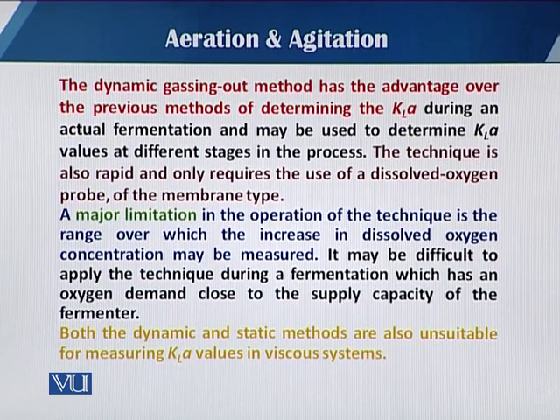The dynamic method has the advantage over the previous static method, because it is the actual fermentation process used for determination of KLa. The major limitation in the operation of the technique is the range over which the dissolved oxygen concentration increases, because this method has its own limitation.